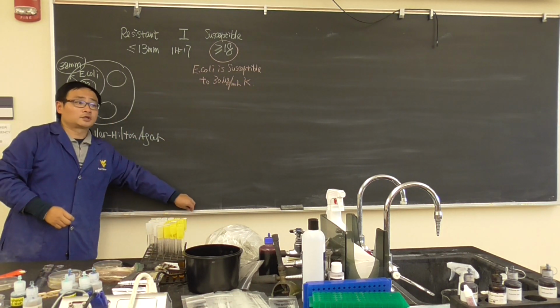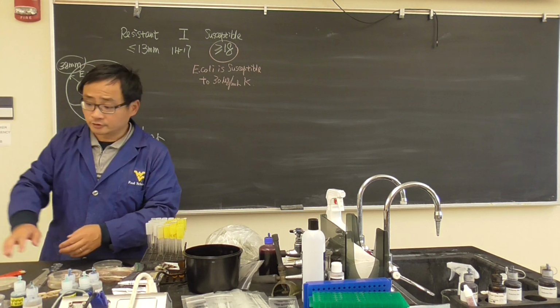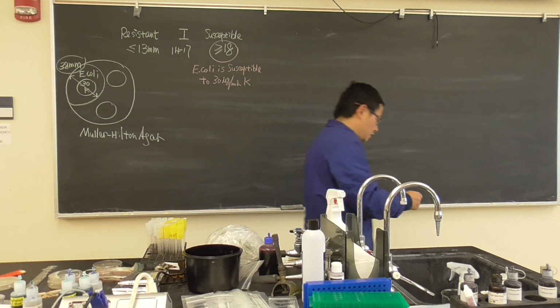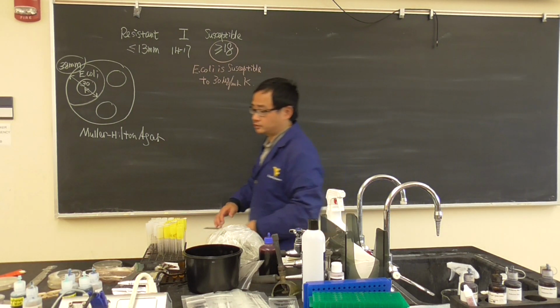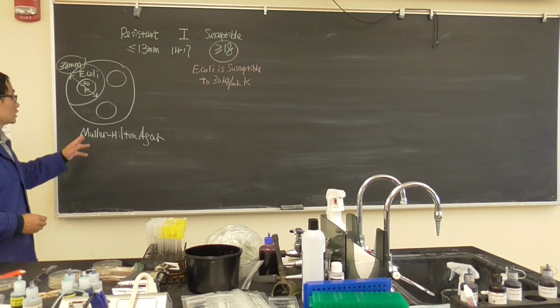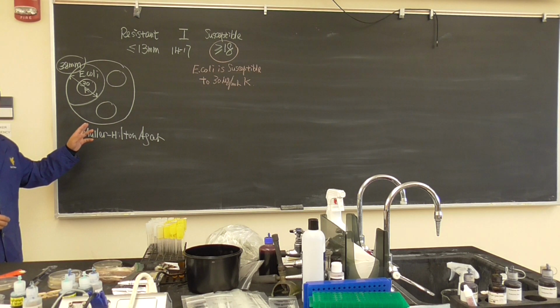Okay? Can you go ahead and do this same thing and measure it? The table is right here. You can measure it. Okay. Let's give an example. Clayton, can you measure your sample? Can you measure one of them that is resistant? Tell me the name and which one looks like resistant. So we're going to give you another example.